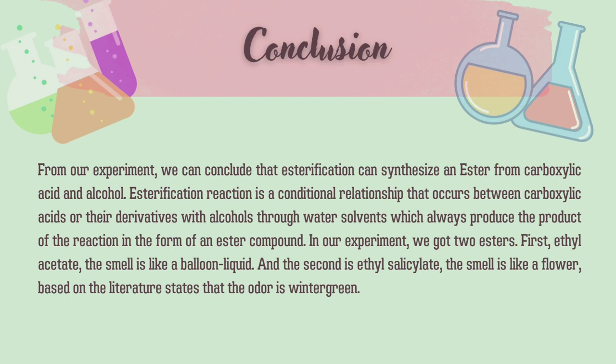In our experiment, we got two esters. First, ethyl acetate. The smell is like a balloon liquid, and the second is ethyl salicylate. The smell is like a flower. Based on the literature, the odor is wintergreen.